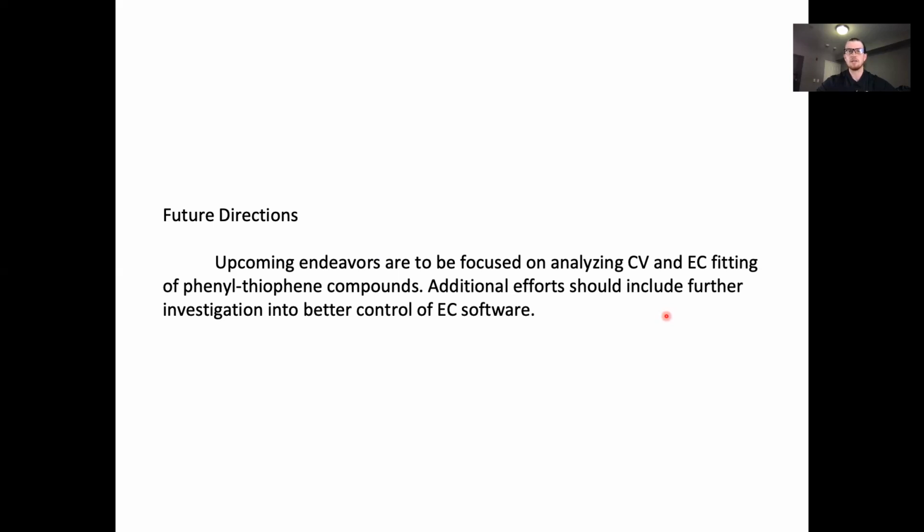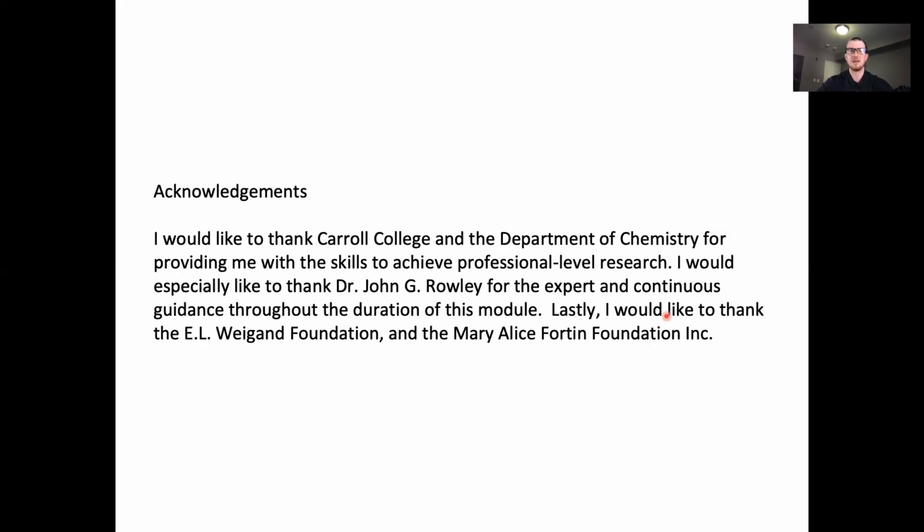And also additional efforts should include investigation and better control of that EC biologic software. That biologic software was a little bit difficult to use and no one in the lab had used it before. So we are still learning how to use it efficiently for simulation and for extracting those mechanistic and kinetic parameters.